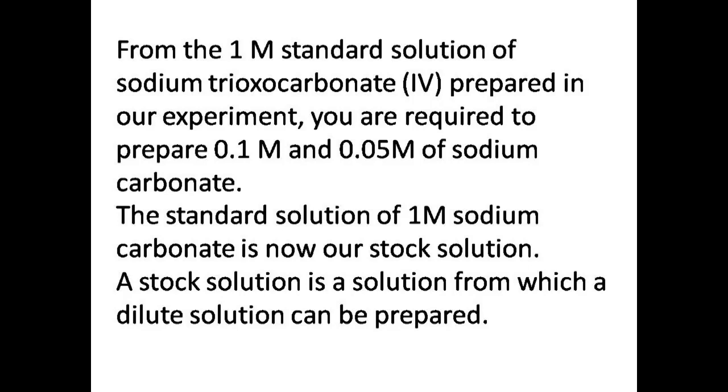In preparing a series of diluted solutions, the standard solution from which the solutions of lesser concentration will be prepared, as we know, will have a higher concentration than the diluted one. The standard solution will be our stock solution. A stock solution is a solution from which a dilute solution can be prepared. It is a standard solution.